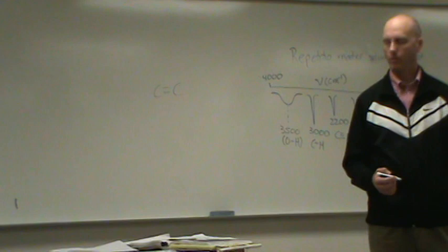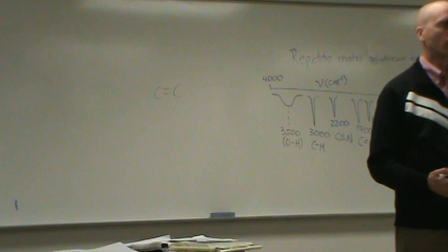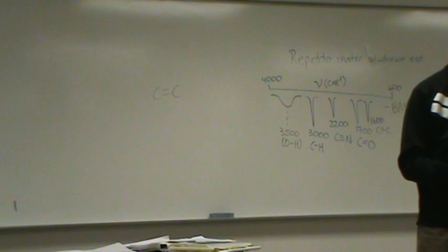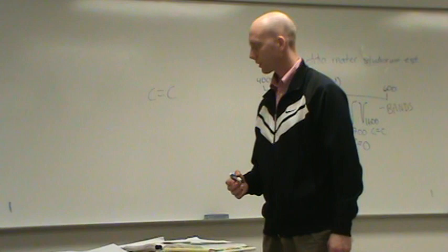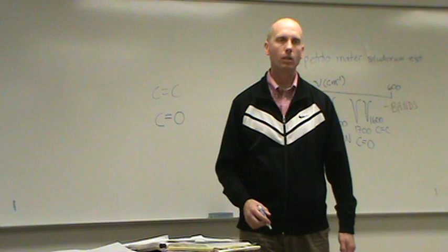Yeah, those are CHs. That's not going to give me much information. There should be something else there that's sticking out. There should be one that has a number on there. Which is a, what's that stand for? Carbon box. Okay, carbonyl. So we got a carbonyl there.